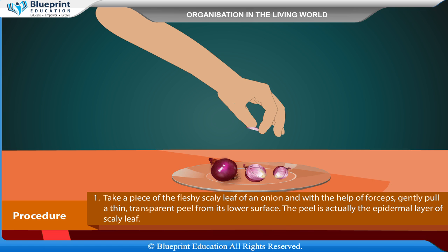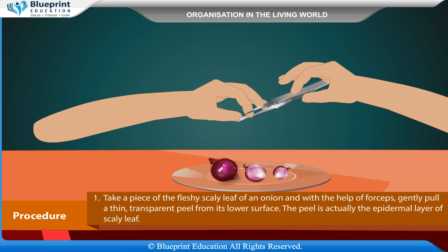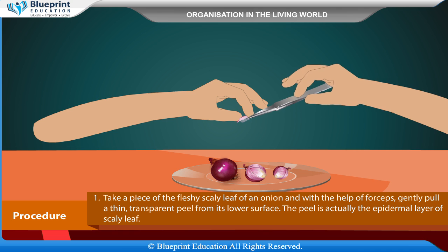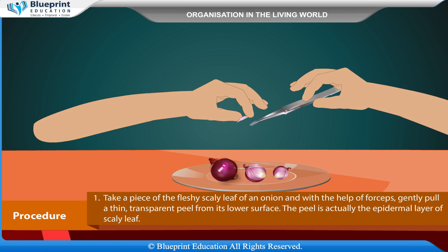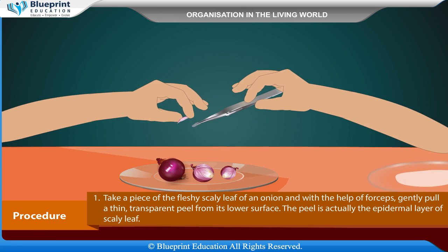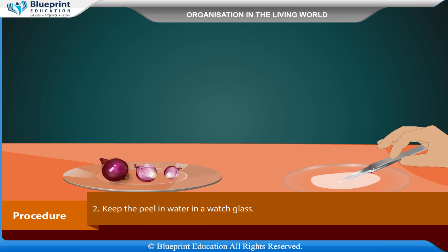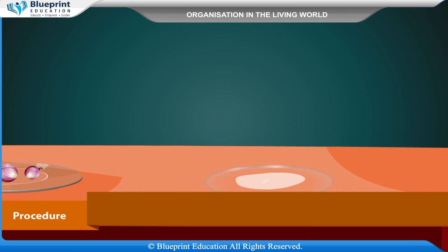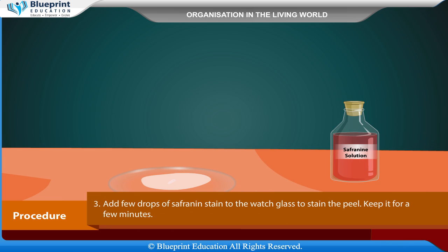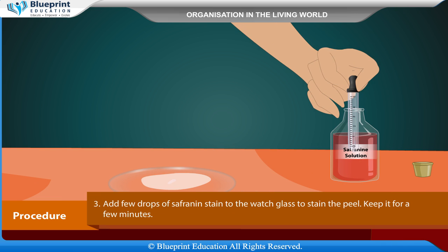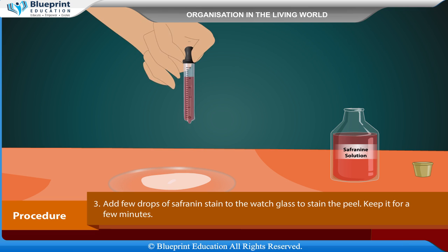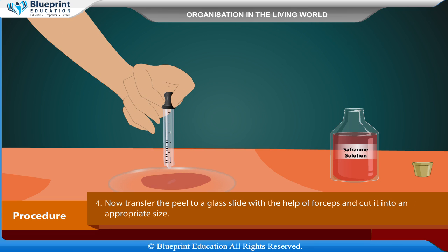Take a piece of fleshy scaly leaf of an onion and with the help of forceps, gently pull a thin transparent peel from its lower surface. The peel is actually the epidermal layer of the scaly leaf. Keep the peel in water in a watch glass and add a few drops of safranin stain to stain the peel. Keep it for a few minutes.